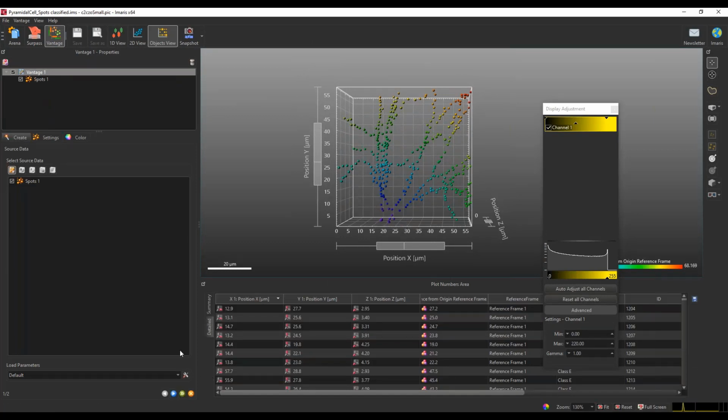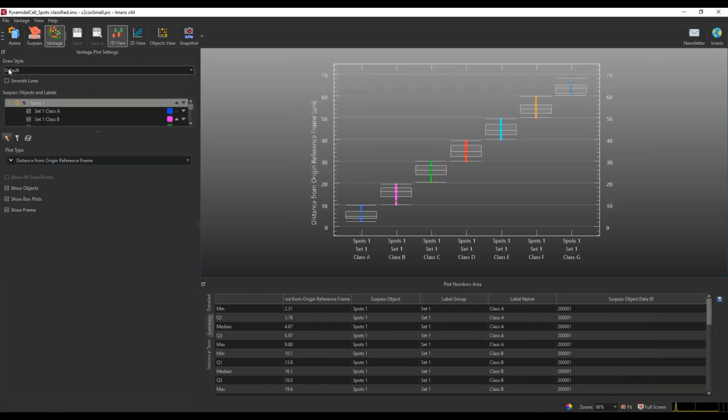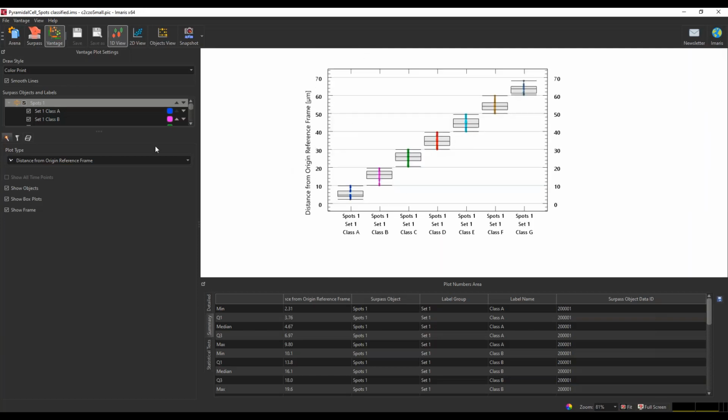Yes, so if I just start here, for instance, on 1D or 2D, you have, of course, here on the left-hand side, by default, this overlay with your own background. I actually have a gradient background here, but you can change this in your preferences. If you want a color print, smooth lines, all the lines will be pretty smooth, and you will have a white background.